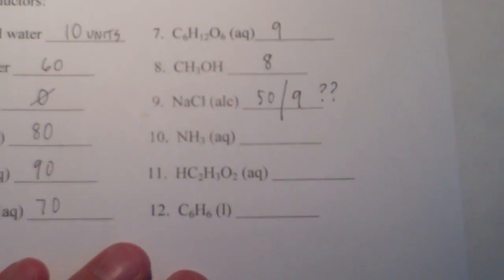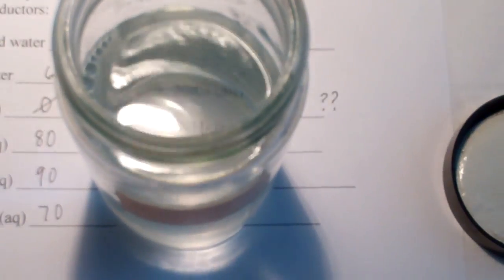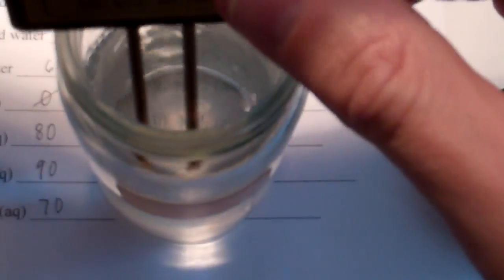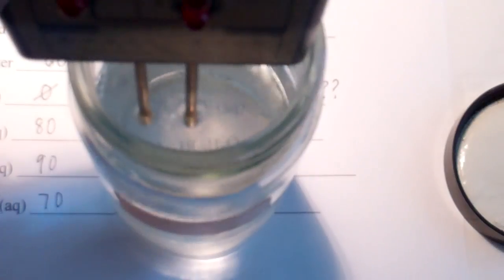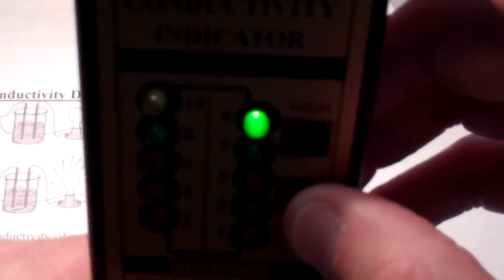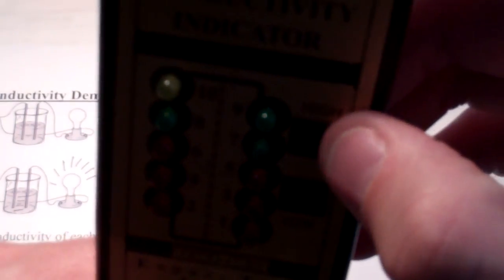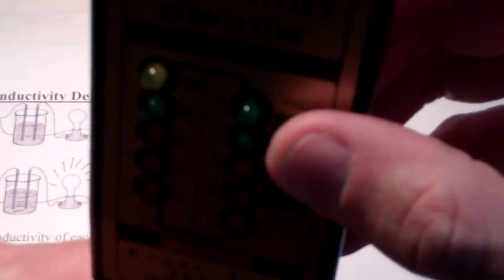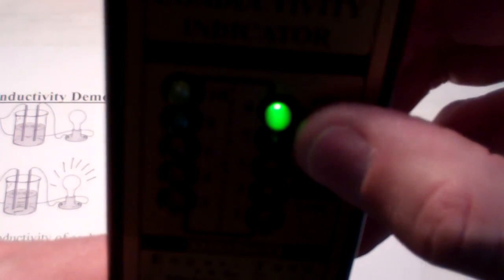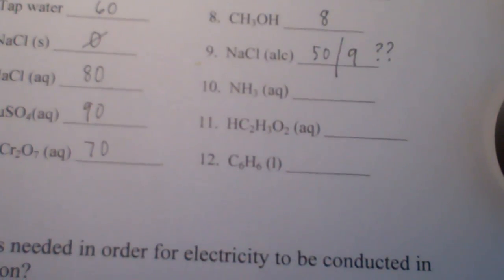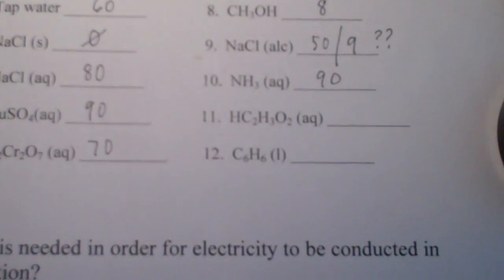Okay. Next up is ammonia. So, let's try ammonia. Does ammonia dissolve ionically? Let's see. We're going to get these electrodes immersed here. We have to do a little bit of work to do that. Put this at an angle. Press the low button. We're at 10 plus. Press the high button. And the ammonia is up to 90 on that scale. So, we will have 90 for ammonia. That's pretty high. So, there must be some ions in my ammonia solution.